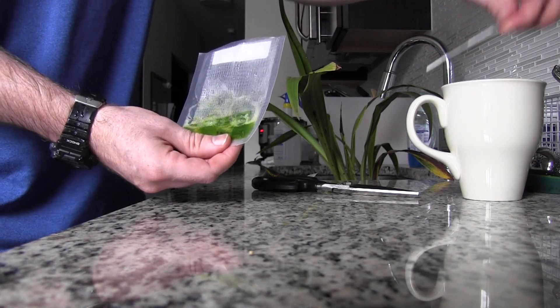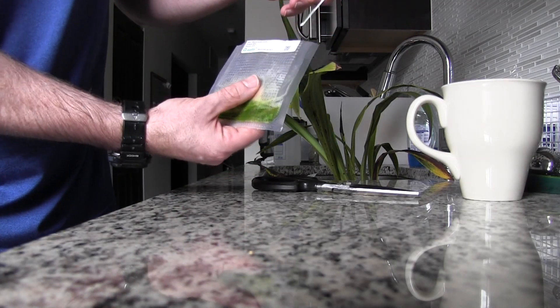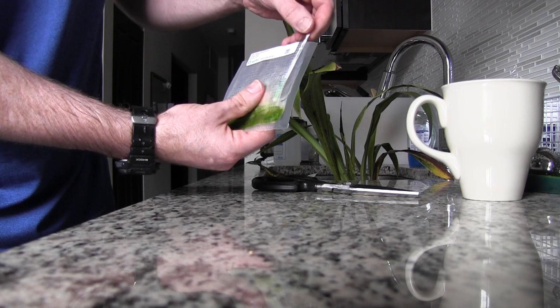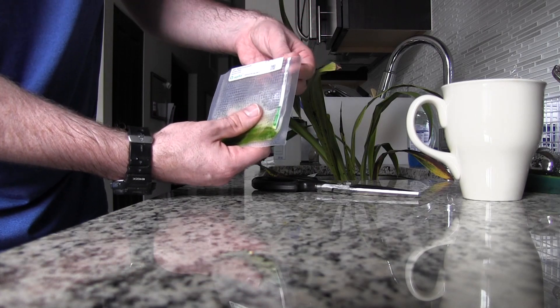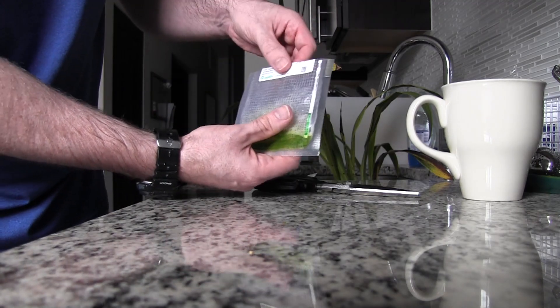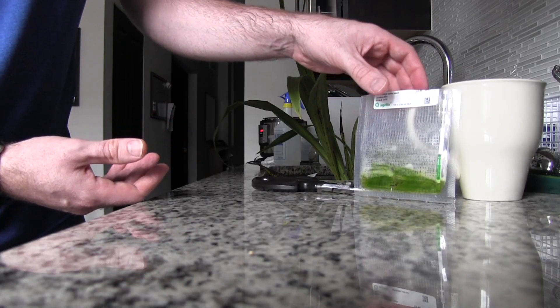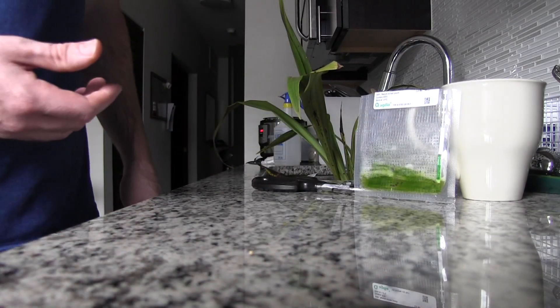Now we're going to take this test strip and slip it down so that it's just touching the green liquid. Then we're going to set it here and watch it — we're going to watch this white section to see what happens.